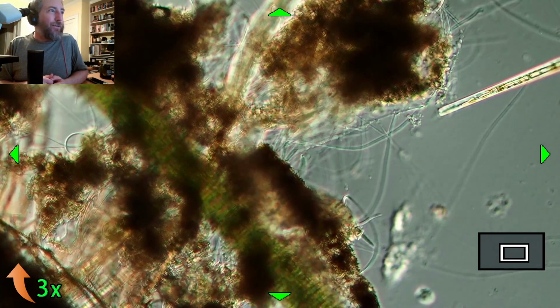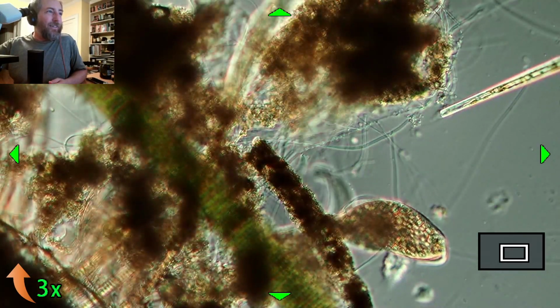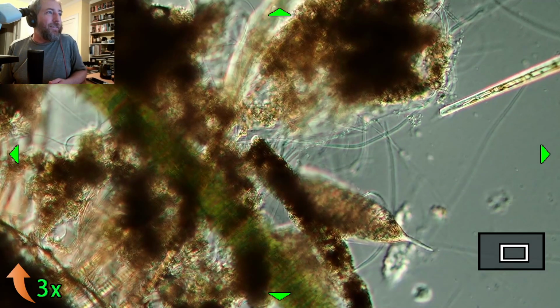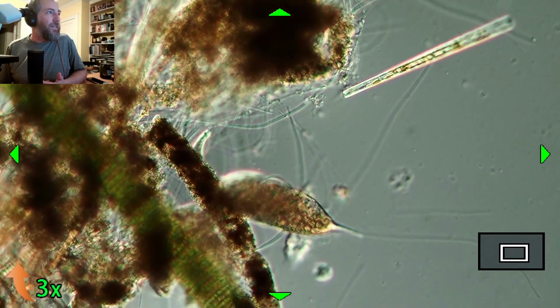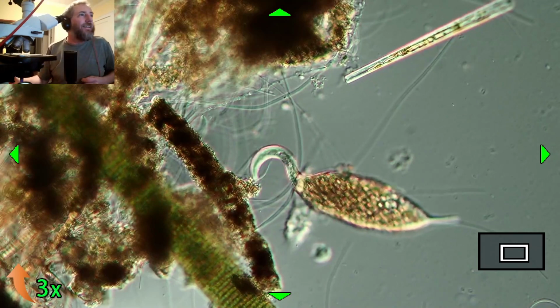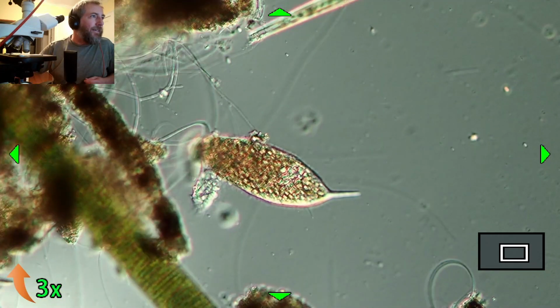Is this live? Yeah, of course it's live. You want to see, I'll focus right now. Now it's in focus. I'm going to zoom in. I'm going to zoom out. Yeah, we're live. It's moving in real time. You're watching what's in my microscope over here. I tweak the control, and that is that organism. That's the actual microscope I'm using right there. And we're watching a Dileptus. Pretty cool looking little guy.